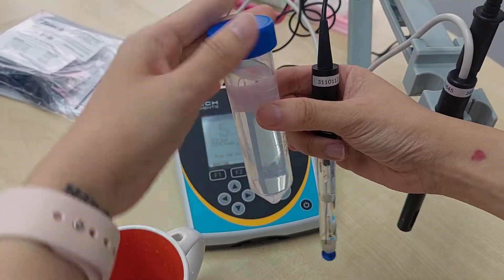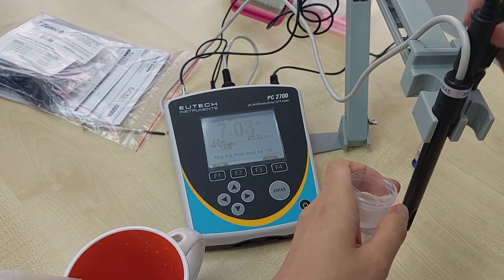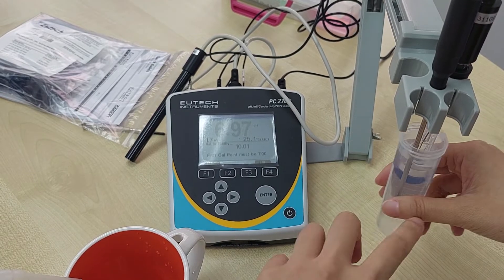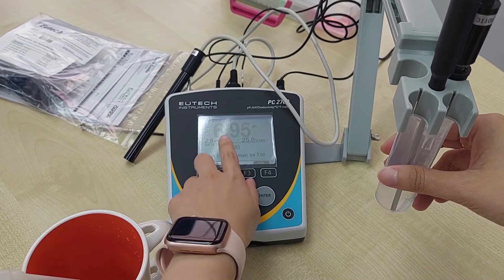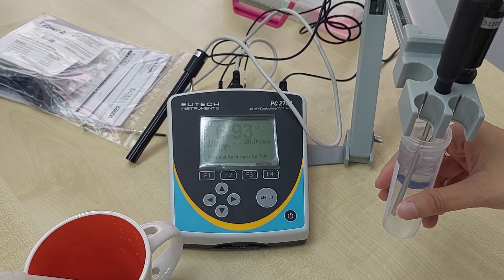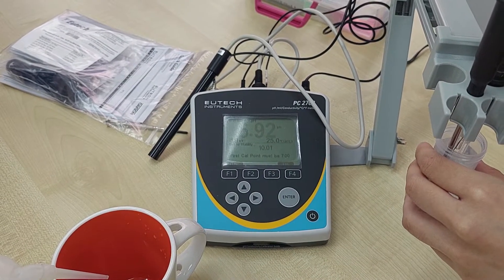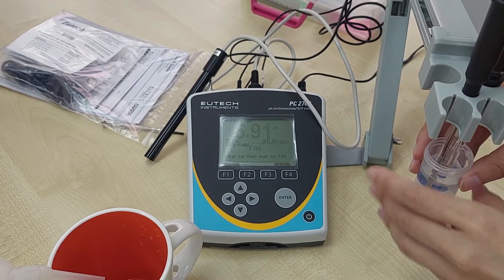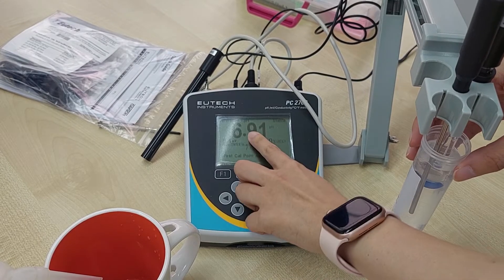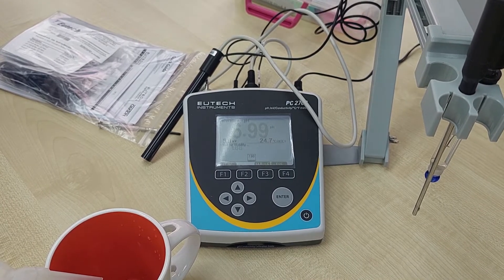Always start your calibration with pH 7. We dip the pH probe in together with the temperature probe. You can see the reading is shown in gray — once it's stable, it will become bold. We'll just wait for it to stabilize. Once it's stable, press Enter. pH 7 is done.